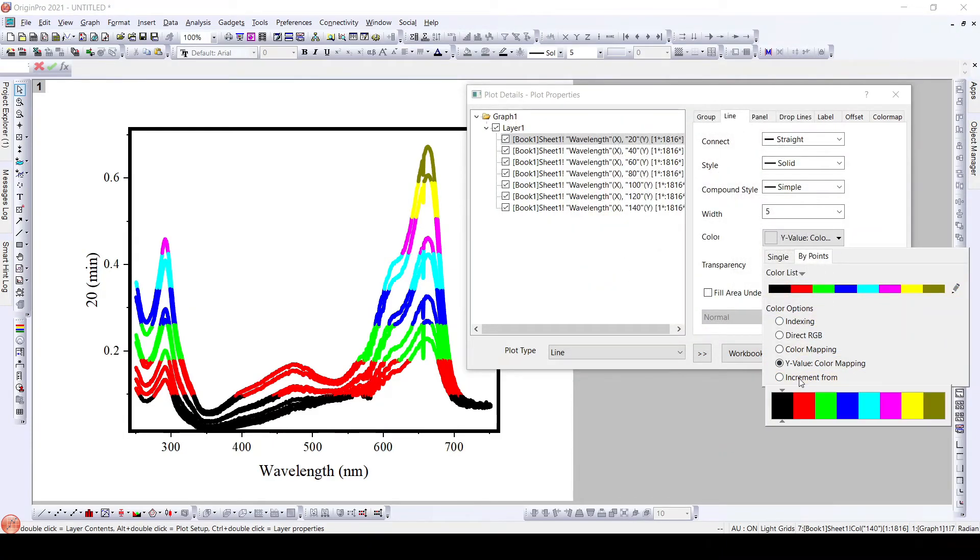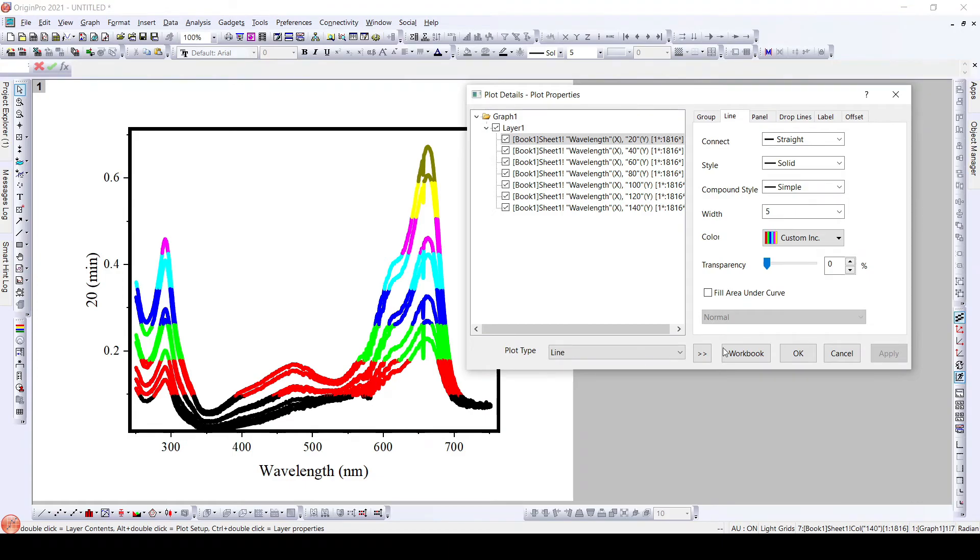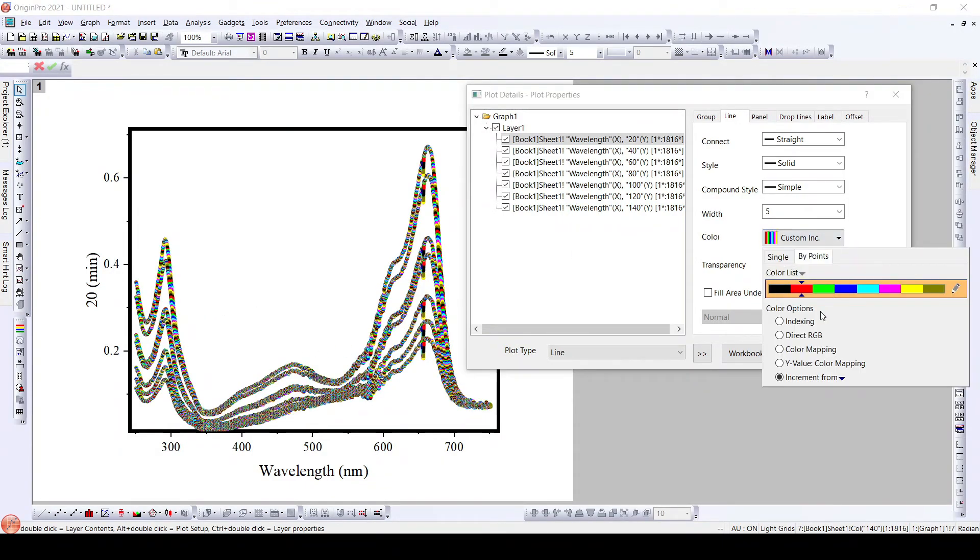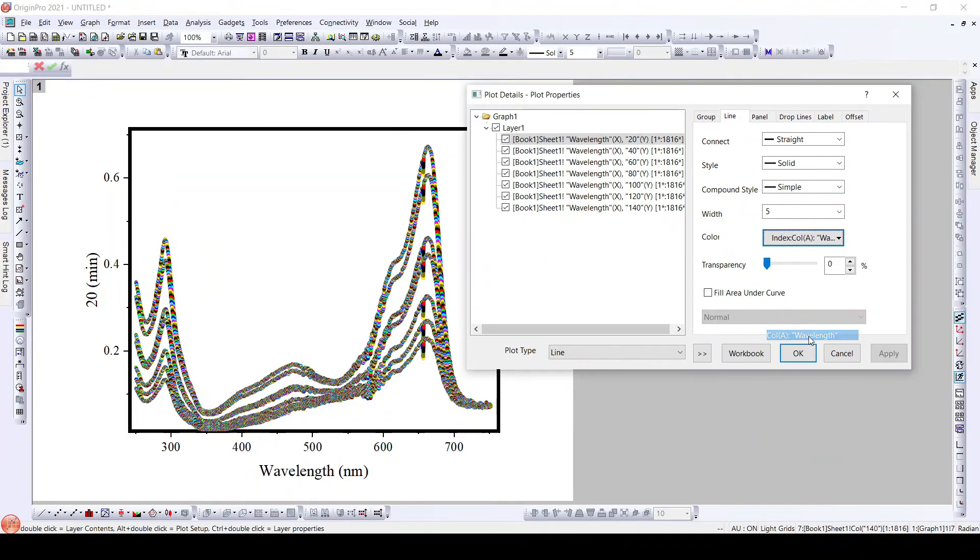Further, increment from we can change the increment from and click apply. So the increment will change for the same that we had initially for indexing, indexing using wavelength, but just the only thing that happened was it started from red not from the black.